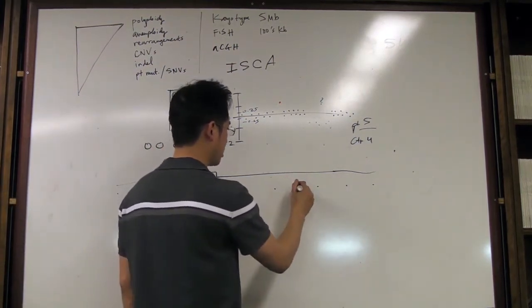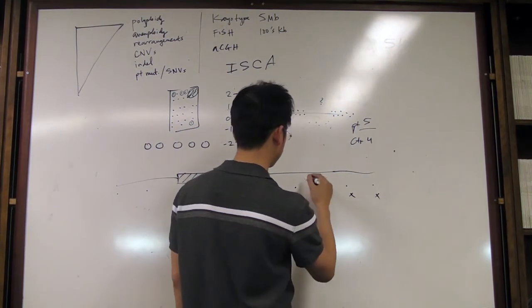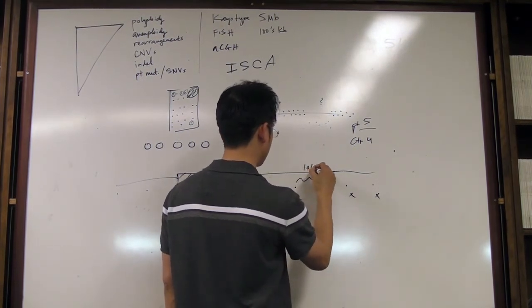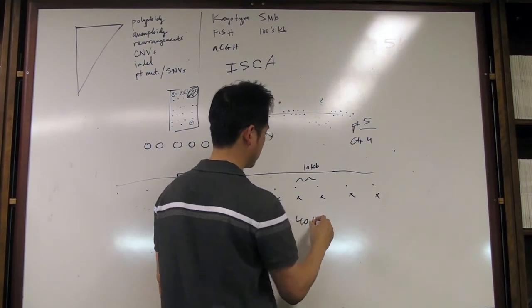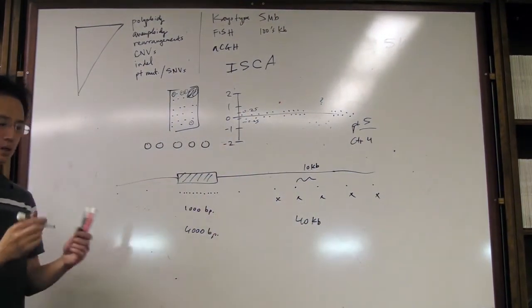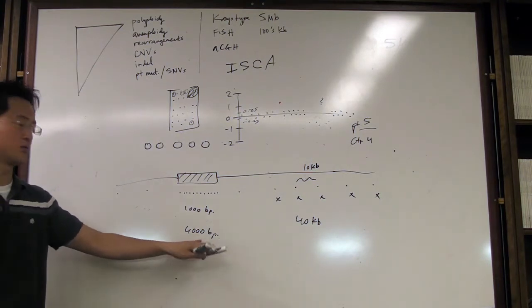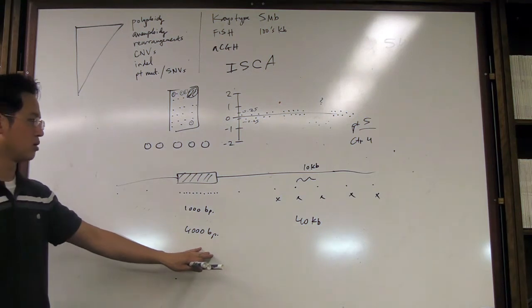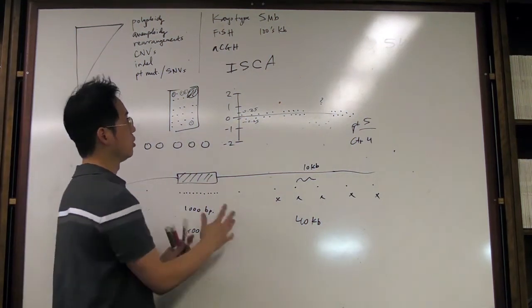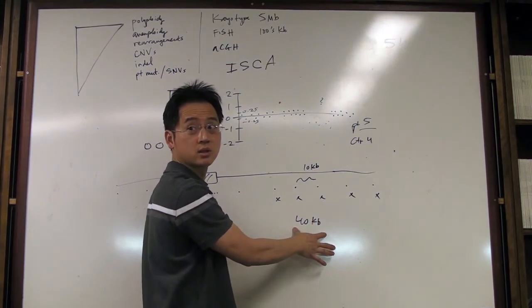But if I get a call somewhere out here where it's 1, 2, 3, 4, 5, and it's spaced every 10,000 bases, then my effective resolution is 40,000 bases. So it really depends on what you are looking at. The disease regions will be covered very well. I'm not sure if this is the resolution that we'll get on that chip that we are using upstairs, but it just really depends. So it can be better than FISH. Even this is already better than FISH on a good day.